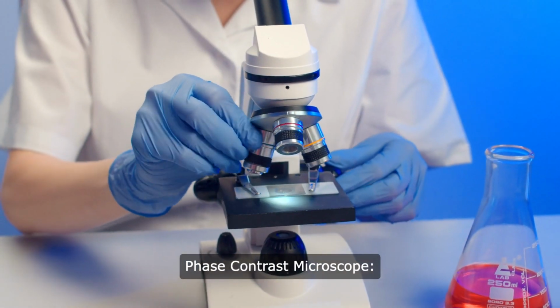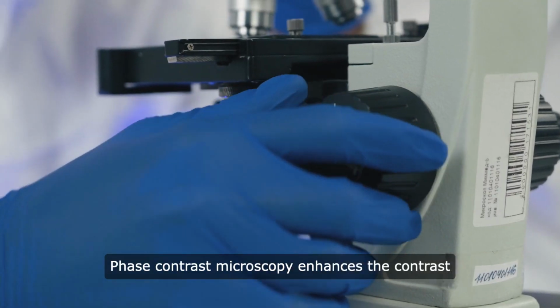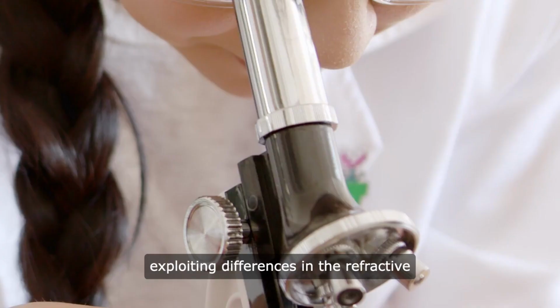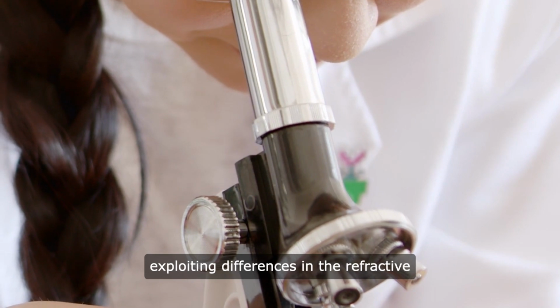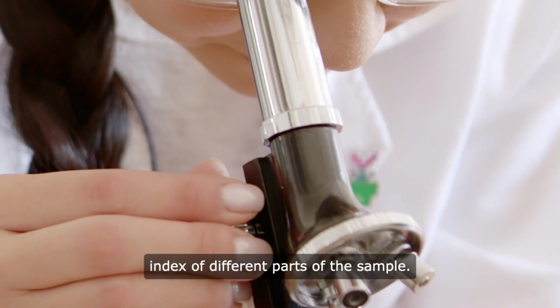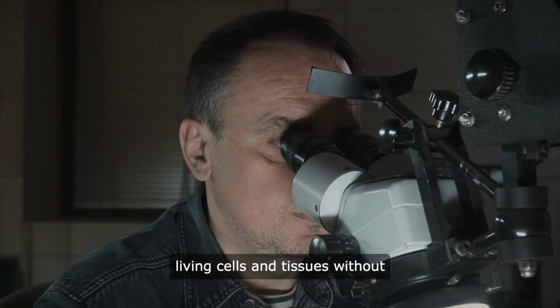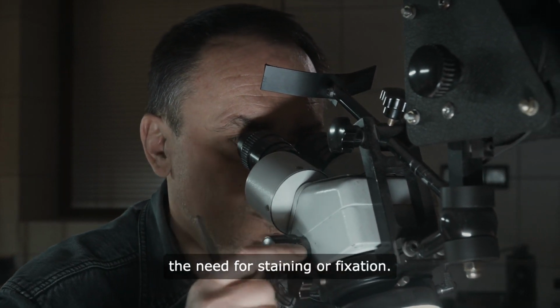Phase contrast microscope. Phase contrast microscopy enhances the contrast of transparent and colorless specimens by exploiting differences in the refractive index of different parts of the sample. It is particularly useful for observing living cells and tissues without the need for staining or fixation.